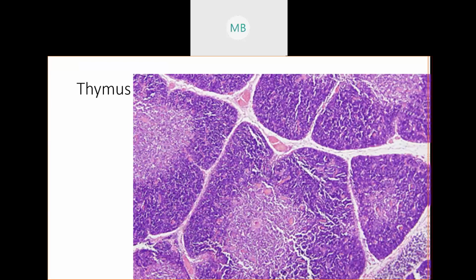But these are under a microscope. They are tiny itty-bitty lobes, so they are called lobules. So all of these little separate buildings or areas that you would see are lobules. Right? So this is a lobule, this is a lobule, lobule, lobule, lobule. There is connective tissue holding all of these lobules together. And that connective tissue we call the septa, which is the word that is on your lab list. Septum is the singular. So there's multiple of these, so you say the word septa.